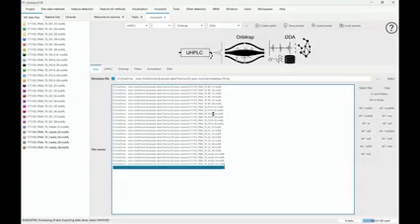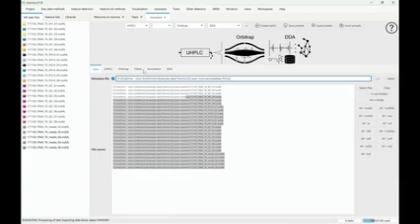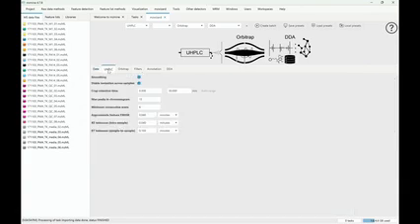So you select the files, you select the metadata, and then we have to set up some of these parameters. And again, if you struggle, you can always ask those people, and also you can just lean back and basically listen to my voice and just follow along watching. But I still want to get some people that really click everything, so it's going to take some time.